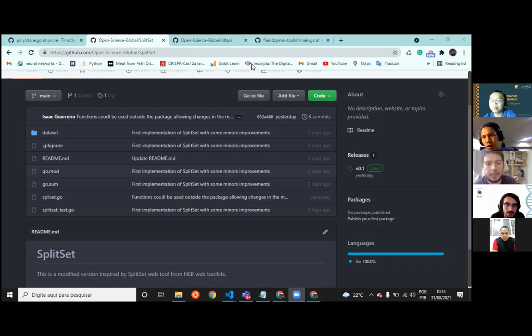Well, so for our SARS-CoV-2 sequencing, what base caller did we use? I think it's Guppy. It was Guppy. Guppy. Yeah. Okay. I'll double check, but I think it's Guppy. So Isaac and Amiro, are you familiar with the basic bioinformatics pipeline of nanopore sequencing? Yeah. Okay, cool.